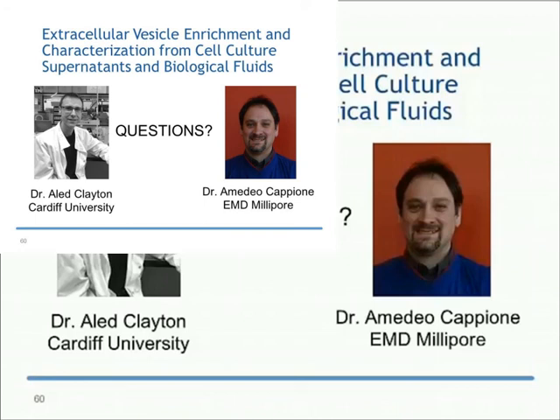But again, this is a very difficult thing to do well. I mentioned OptiPrep gradients as a strategy for doing so. There may be others. And again, this is very difficult to do with absolute certainty that you have no virus in your vesicle prep. So, you know, play safe. If you do have a system involving virus, then I would absolutely do all my work relating to vesicles in a suitable biological safety cabinet and not take any risk with handling the material and assays either. So do all that in the Class 2 safety cabinet, sure.